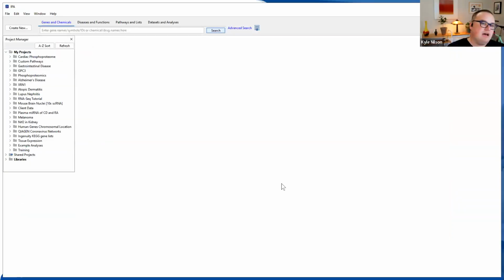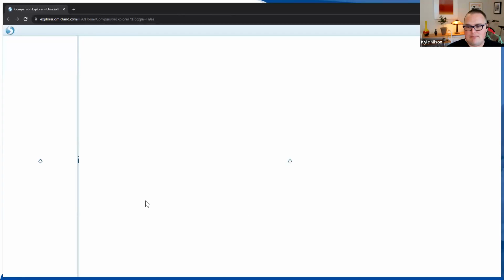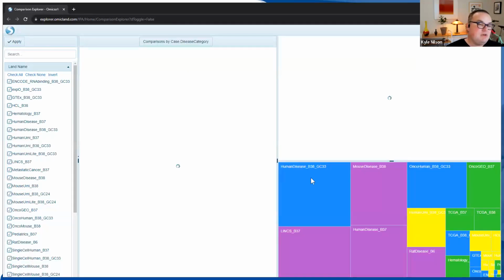First, you can always ask in the Q&A box. Paul Daniel would be more than happy to help you verify. But also, within IPA, we have a link in the top right corner of the IPA window that you can always click to load Land Explorer. And that in a new browser window should bring you to a landing portal for that page. And if you can access this, then it's included in your existing license.